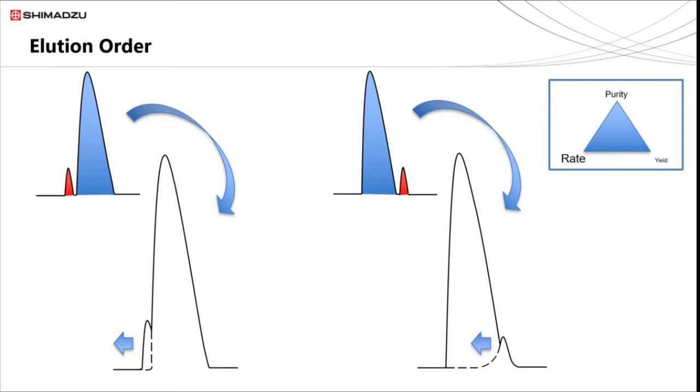We are not always lucky enough to be able to make sure our impurity peaks elute before a major band rather than after, but in the case of chiral separations, some chiral phases are available in opposite enantiomers, thereby giving you the option of switching elution order.